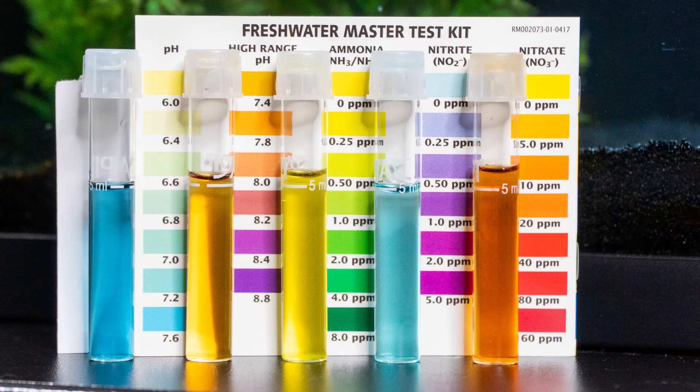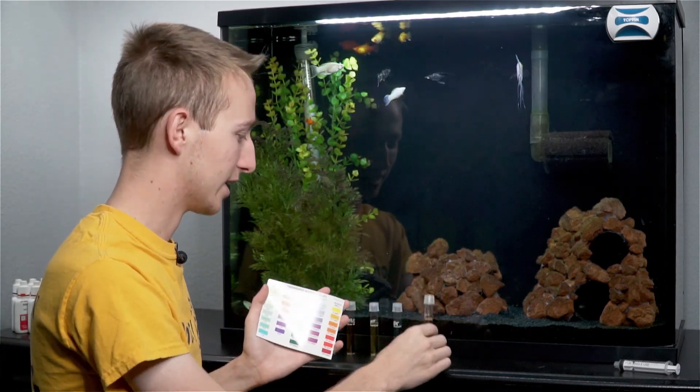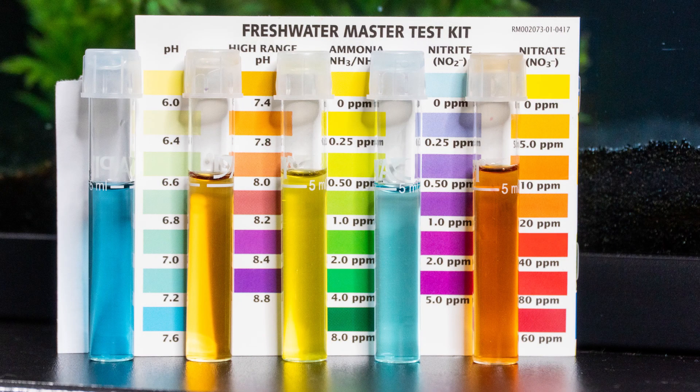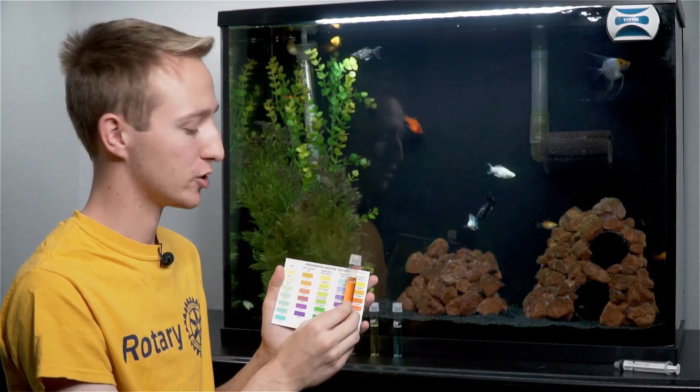For nitrite, it's that nice light blue, so that means there's zero ppm of nitrite — that's what you want. Nitrite and ammonia are both poisonous to fish. Now this is water change day for me, so my nitrates are definitely going to be high. I would say this is reading about 20 ppm of nitrates. I'm going to change my water as soon as I'm done with this video — it's definitely time. I don't like nitrates to get above 20 ppm.